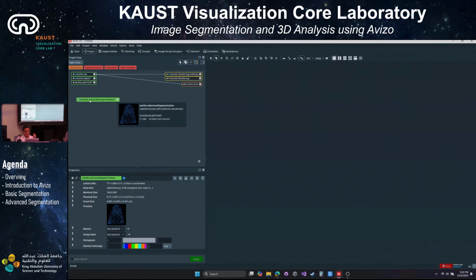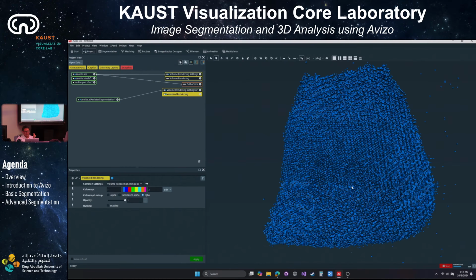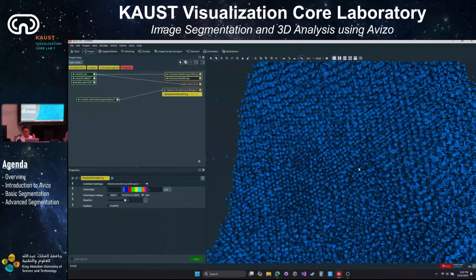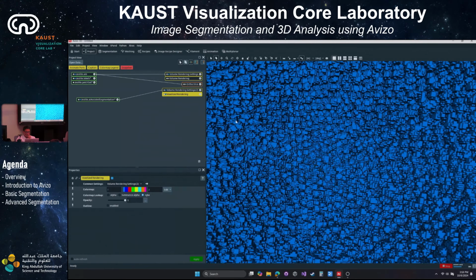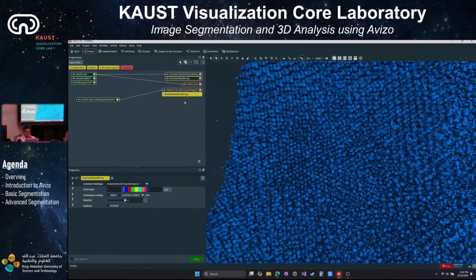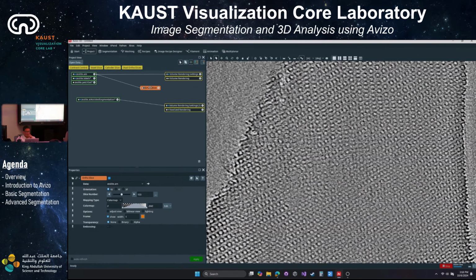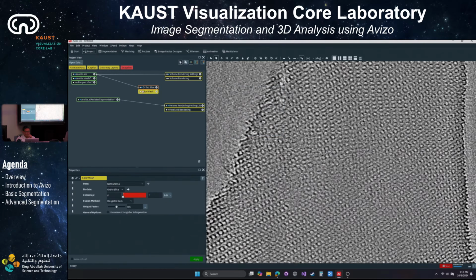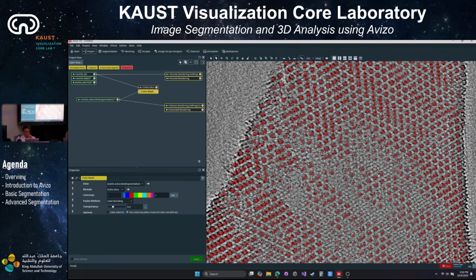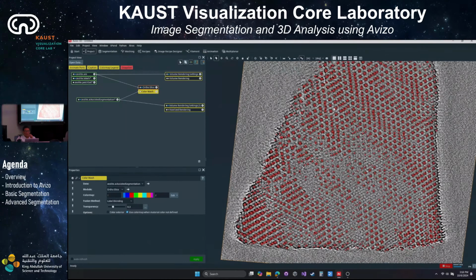So you say zeolite.ai assisted segmentation. And if I look at this in 3D, it's amazing. I don't know if it's obvious to you. Wait, what's the best way? Let's do this in 2D, right? So you can do an ortho slice. This is another trick. If you load an ortho slice and then click this here, add color wash, you can connect the segmentation. Look at that. Look at that, right? So this is the original scan, and we overlay the result of the AI segmentation.